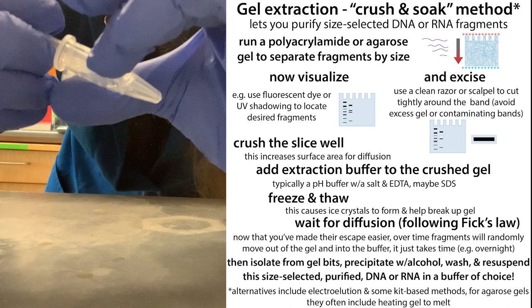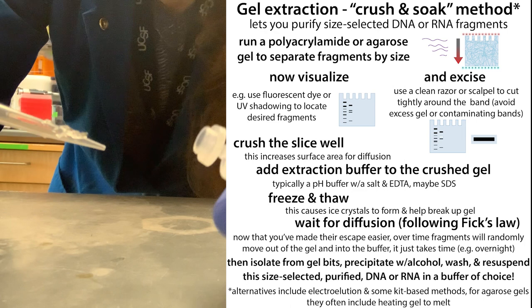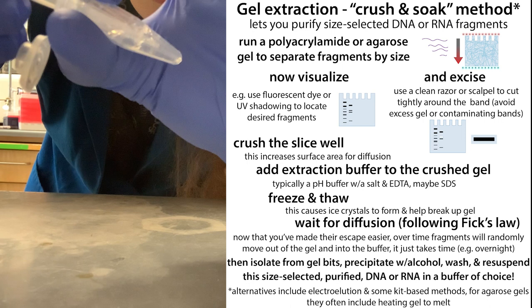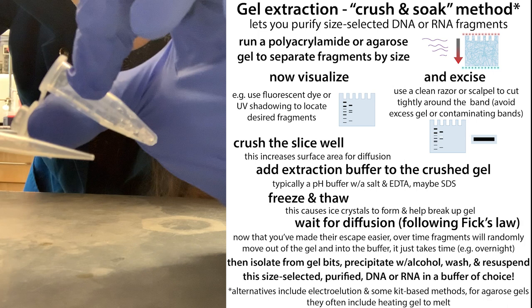Crush against the sides of the tube — you're going to have to apply a lot of pressure. You want small pieces, which gives more surface area for your nucleic acids to escape. The smaller the pieces, though, the more likely they are to get stuck on the outside of your tip. So instead of just pulling the tip straight out, spin the tip as you pull out while pressing on the wall, watching to make sure the gel material is coming off the tip and onto the tube walls. You may need to do this a few times to get it all off.